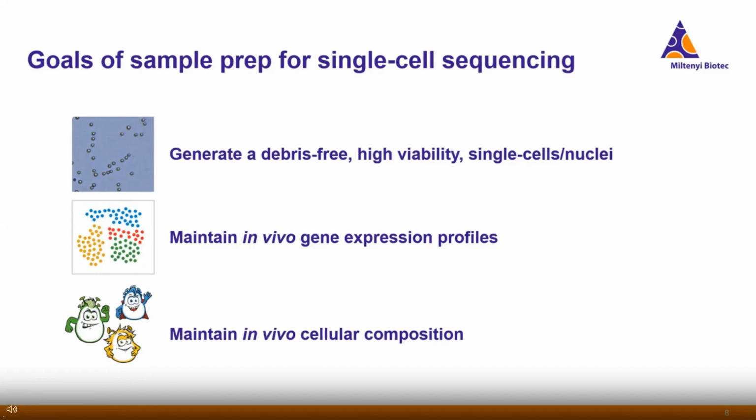Likewise, if you're working with nuclei, you want it free of debris and cell aggregates, but instead of high viability, you're looking for nice intact nuclei. And then here's the hard part. You also want to make sure you're maintaining the in vivo expression profiles of your cells as well as maintaining the in vivo cellular composition.